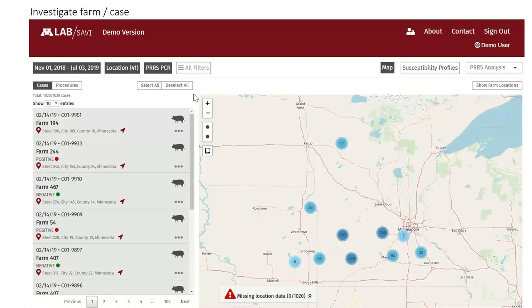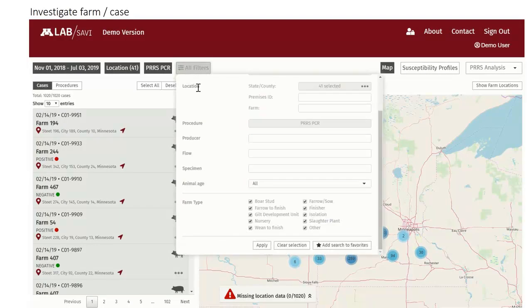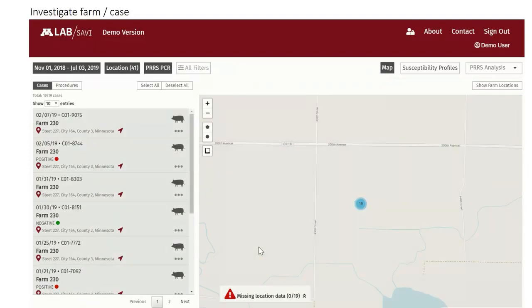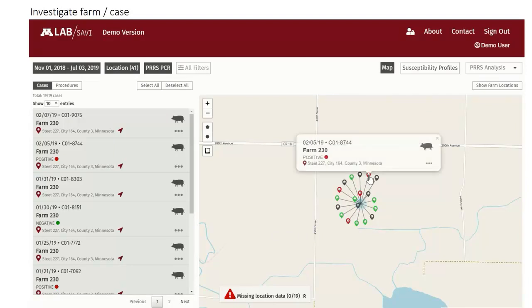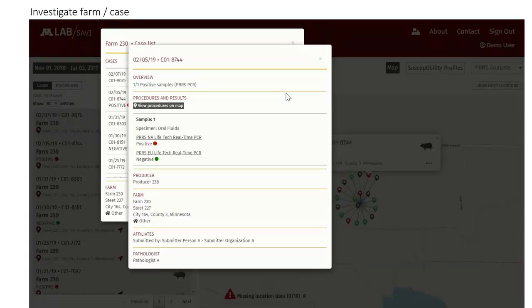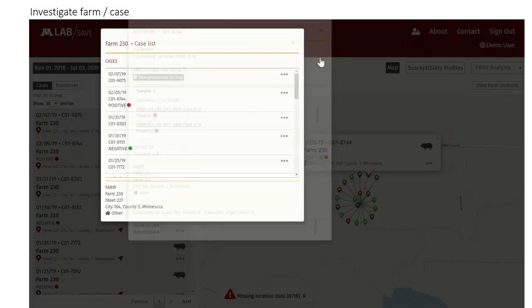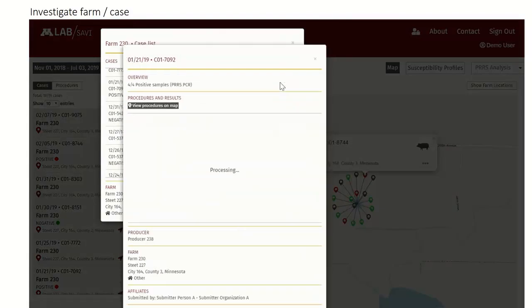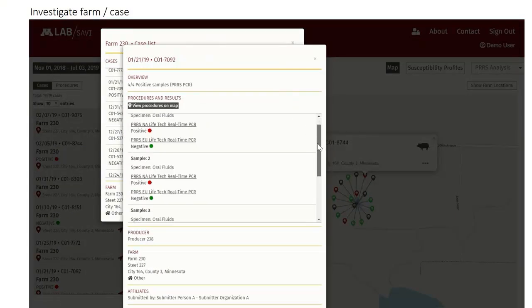Now if you want to go in and look at a specific farm or a specific case, again, we have filters that allow you to do that. You need to know the name of the farm, obviously, and you can conduct a search that way. And then if there are also other parameters that you've included in your submission information, such as flow or other parameters, you can go in and look up and click on the pinwheel, call up that case, or call up the range of cases and get more background information on it. So I think it's a very, again, intuitive, easy to use tool just to get in and look up cases very quickly and make some comparisons if you want. Okay? So again, more details on specific cases as needed.